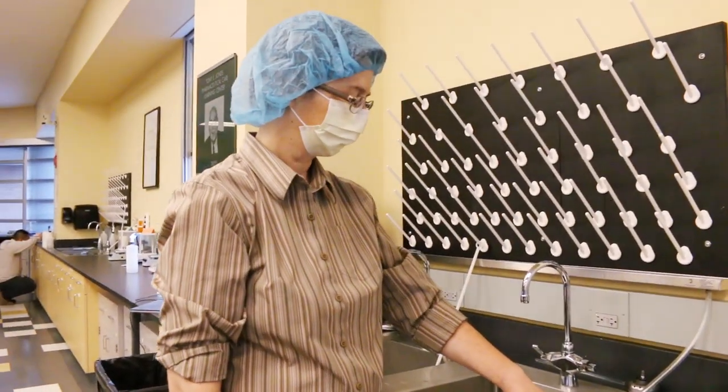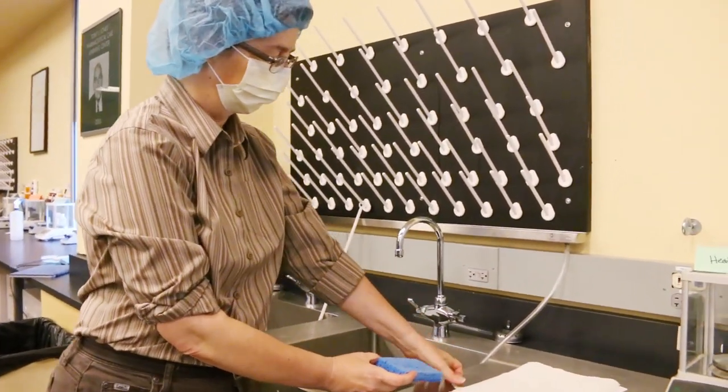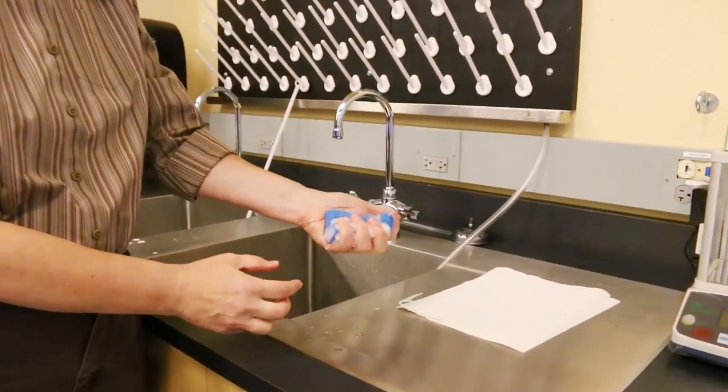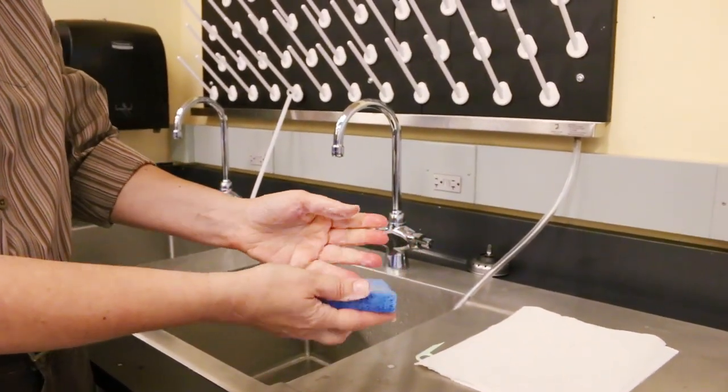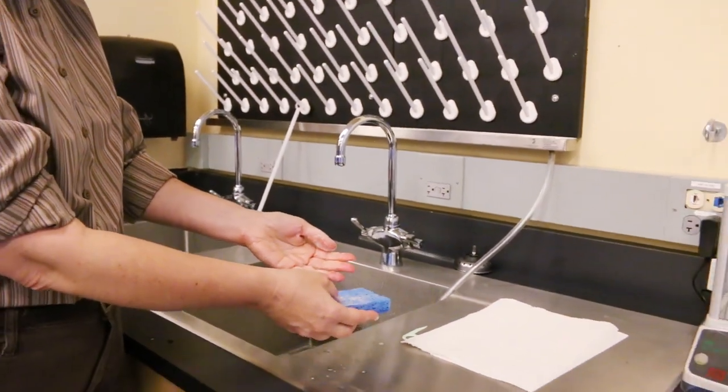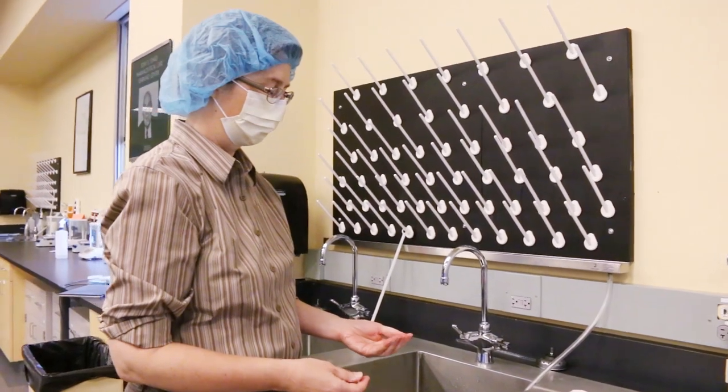Step 9, we move to the sink for aseptic hand washing. 9A is to squeeze the surgical scrub sponge or brush several times to activate the soap suds. 9B is to open the packet, removing the sterile sponge or brush and hold that in your dominant hand.